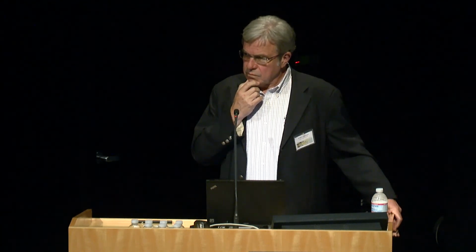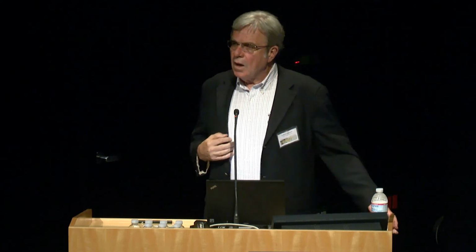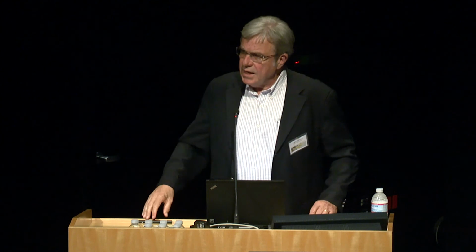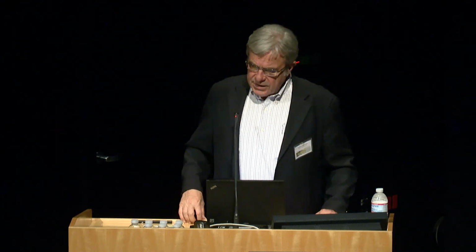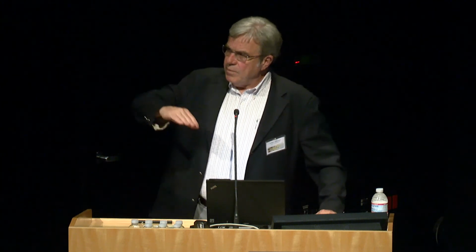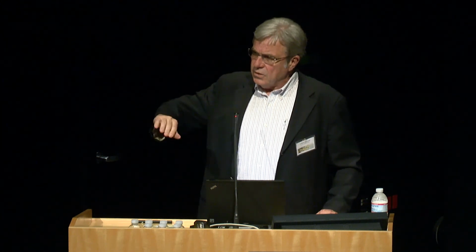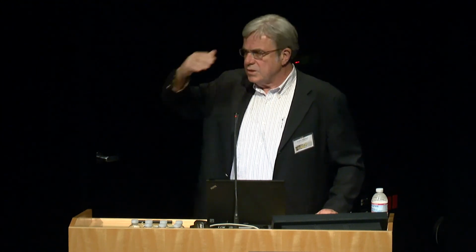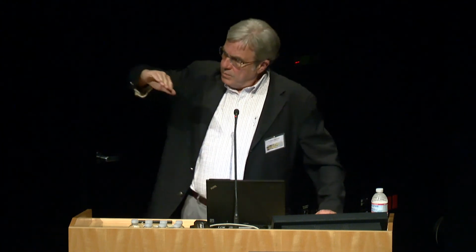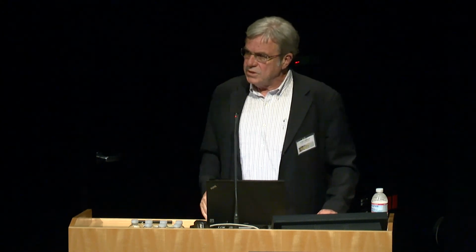Would you like to speculate on the function of the pH change and why it lasts so long? So yeah, we studied the pH change in relation to the oxygen change, and they track each other. The oxygen change actually occurs a few milliseconds before the pH change, but the duration of them are very similar, and the direction in which they go.